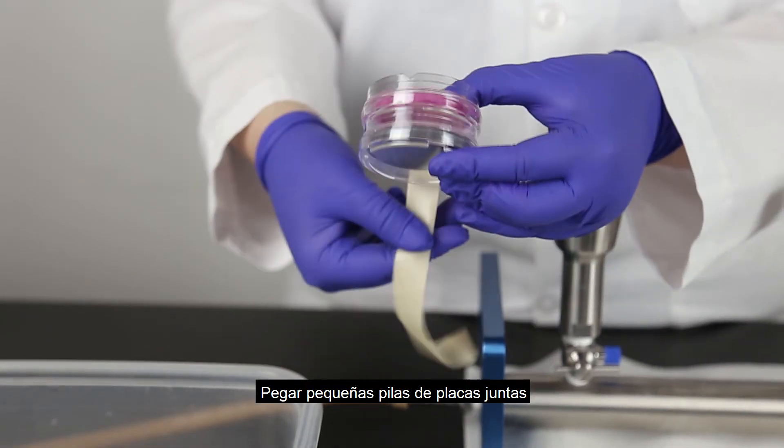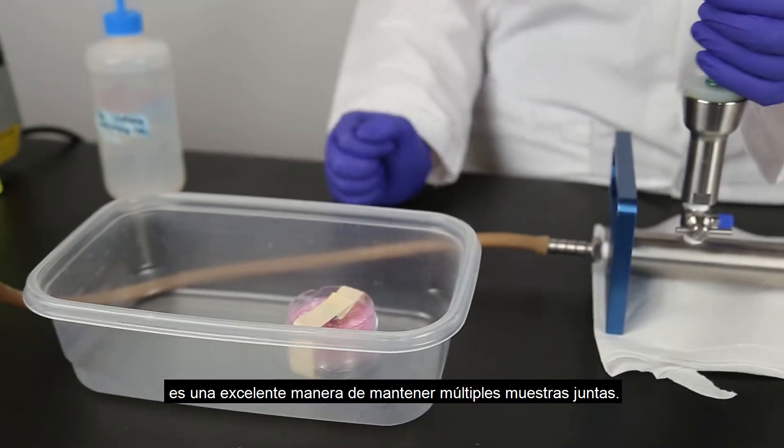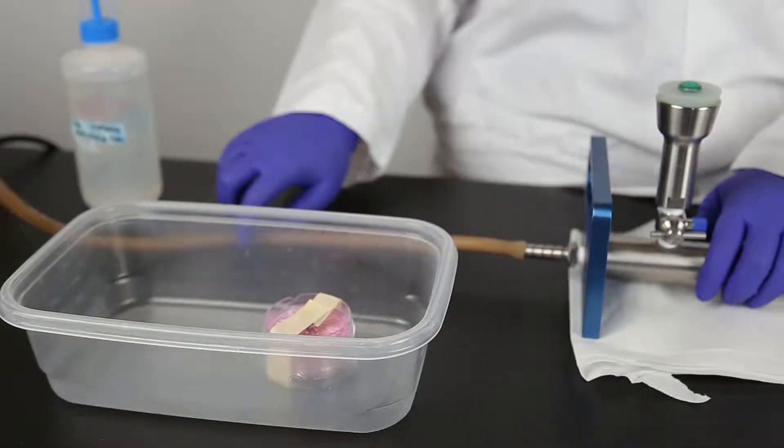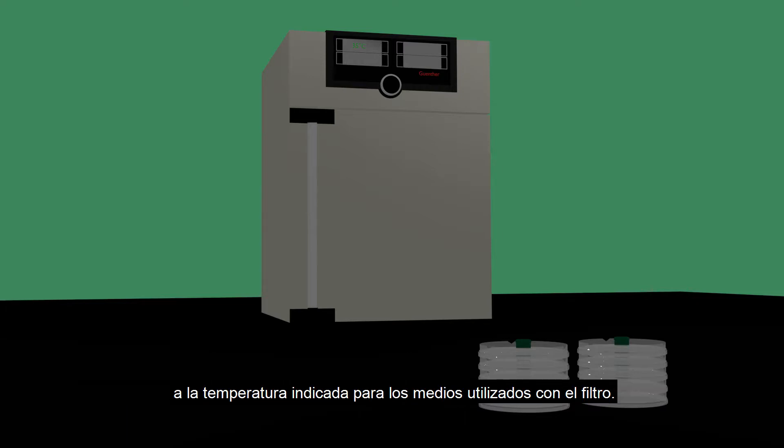Taping small stacks of plates together or using a Tupperware container is a great way to keep multiple samples together. You can now incubate the Neogen Filter Petri Dishes topside down at the temperature indicated for the media used with the filter.